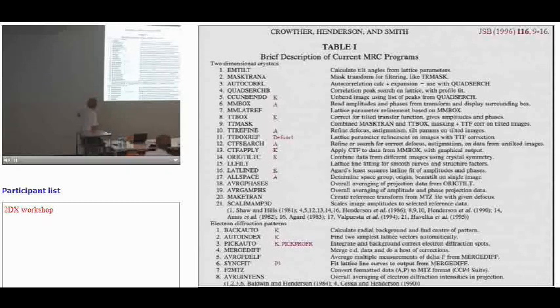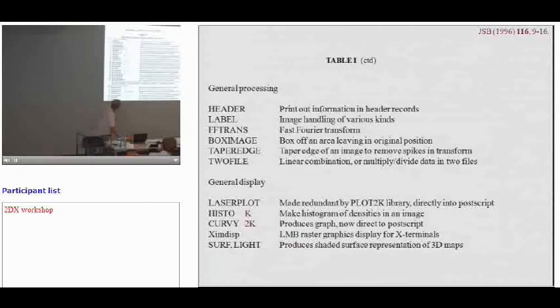But obviously, they've continued to be changed, modified, debugged, and developed. And in the year 2000, we had a different set of subroutines for plotting out the results, so you get this nice graphical output. That was called Plot2000 or Plot2K. So when we had a K on it, that means it usually has some plotting involved. So CCUNBEND, the unbending program, is now called CCUNBENDK. And then others had A. So anyway, that's just an overview of it.